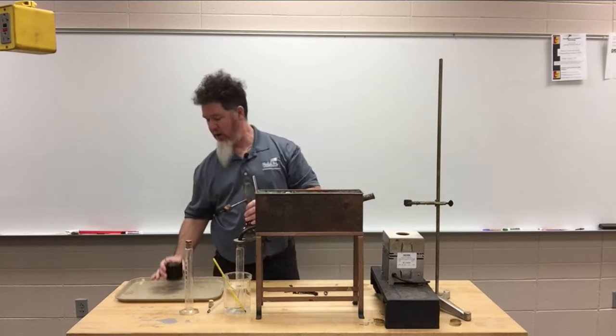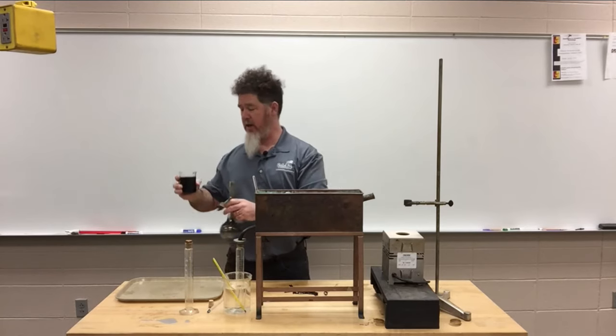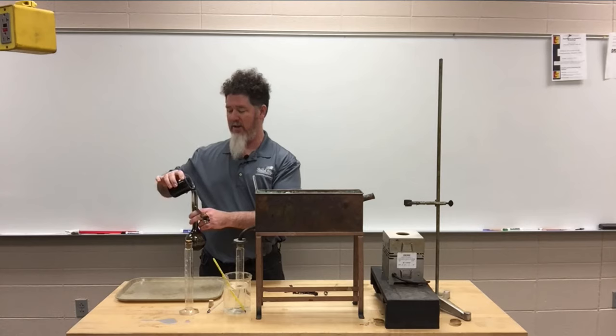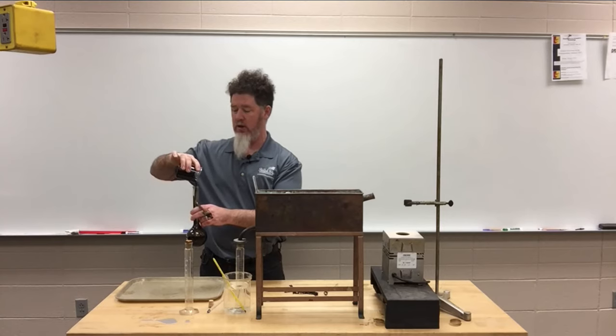What I have already here is 200 milliliters of crude oil from Barton County here in the area. Students will help me get crude oil on occasion, and it'll last me quite a while if I only do 200 milliliters at a time. You want to start off with a known quantity of oil because you want to know what percentage of your fuel you get.